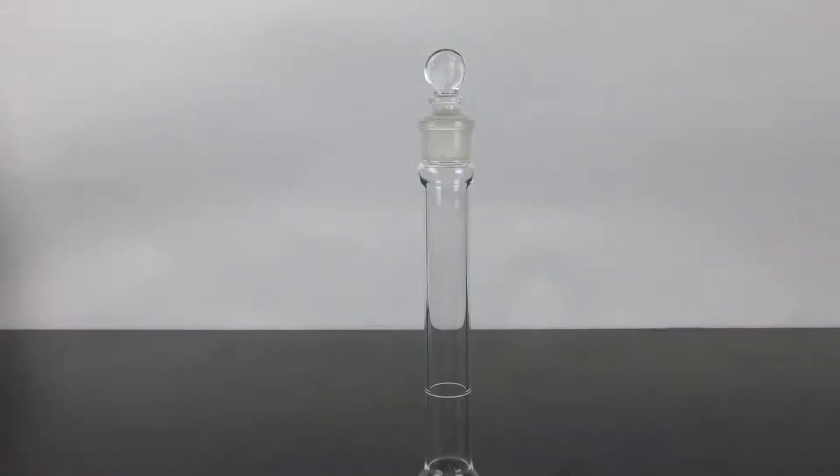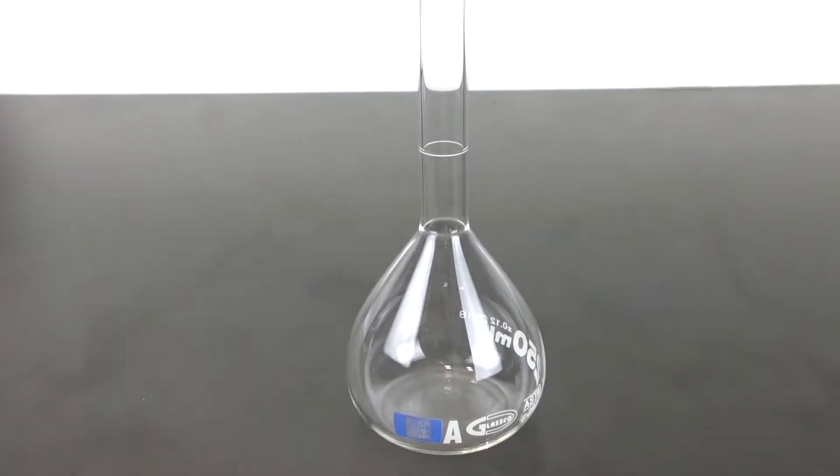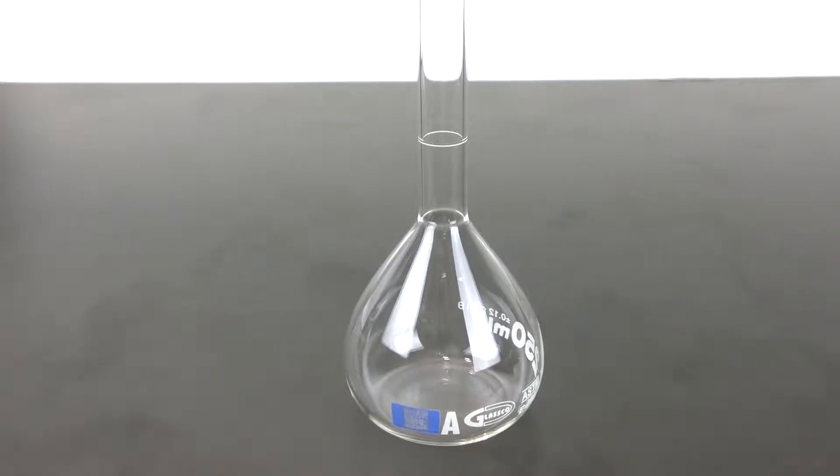These durable volumetric flasks have a heavy beaded tubing neck, a sharp graduation line, large white block letters, and meet Class A specifications per ASTM E288.